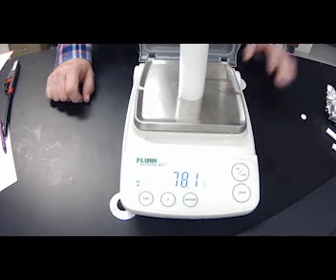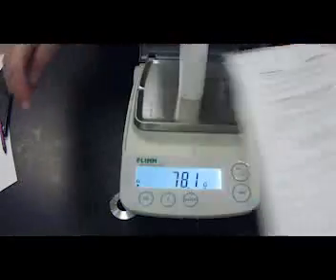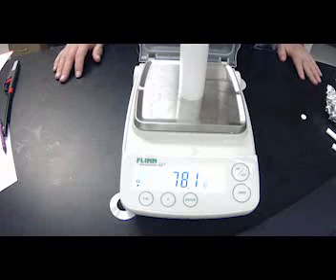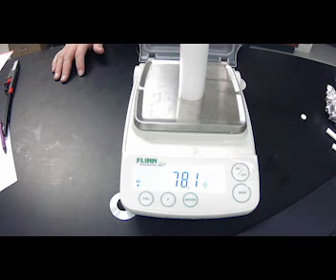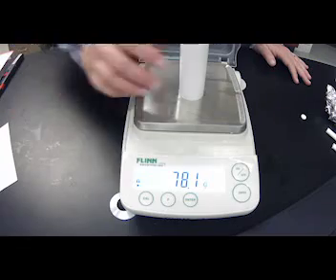So in your mass before, you're going to put 78.1 grams. And then I'm going to have a timer here. We're going to let this burn for 5 minutes. I'm not going to have you guys sit here and wait, but we're going to burn it for 5 minutes, and then we will weigh it again.